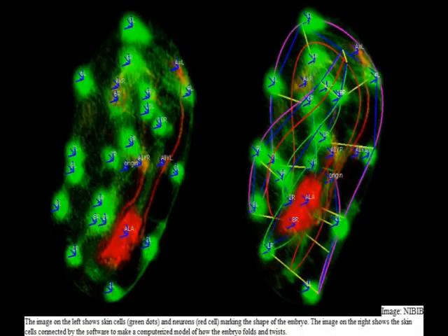The worm known as C. elegans has only 302 neurons, 222 of which form while the worm is still an embryo. The worm even has its own versions of many of the same proteins used to direct brain formation in more complex organisms such as flies, mice, or humans. The software is described in a paper published in the open access journal Life.